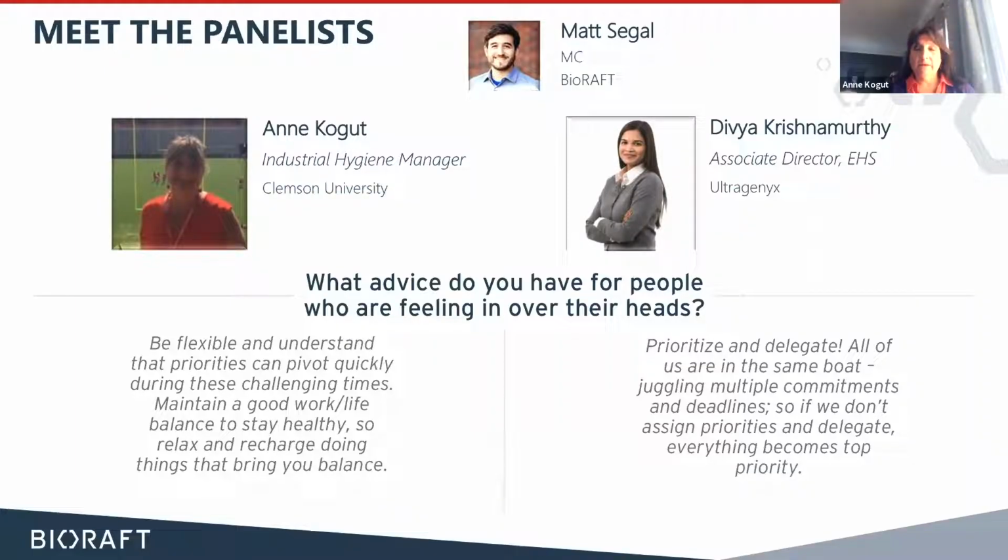Well, like I said before, each PI or each lab is responsible for their own inventories, as well as tracking any purchases, because we aren't allowing deliveries directly to the buildings. They have to make arrangements so that if they are purchasing any new chemicals, those come in through our general store area, which is normally what we don't do, and then keep track of that as they come in.